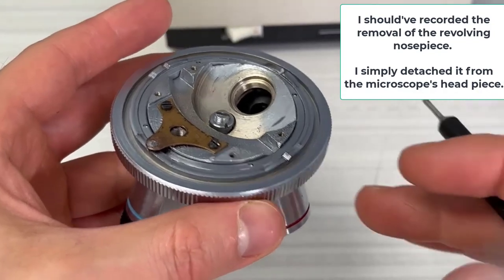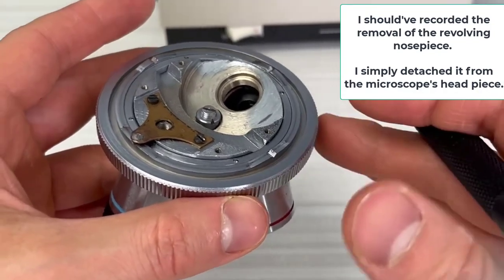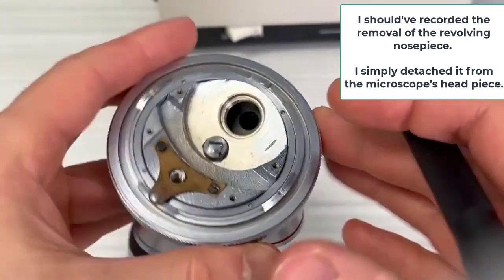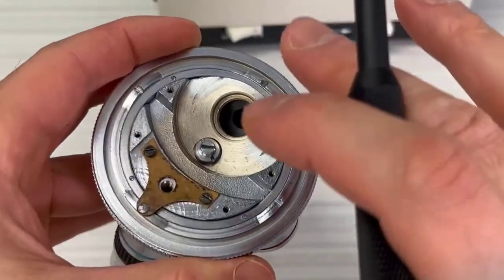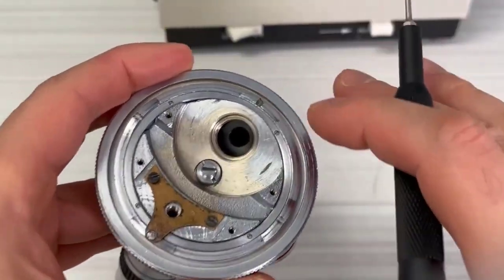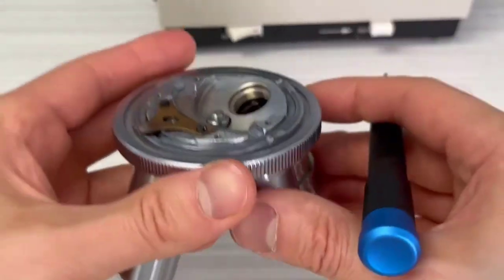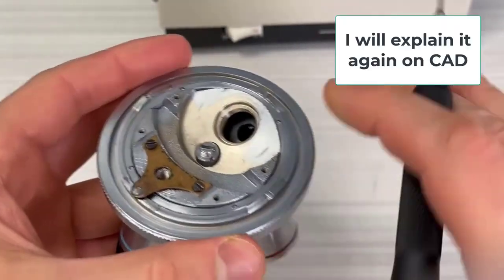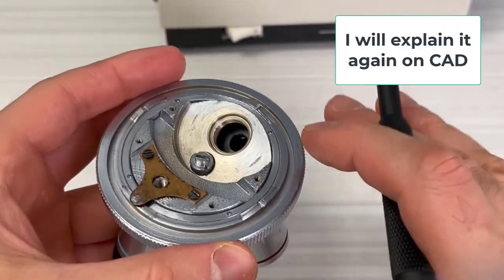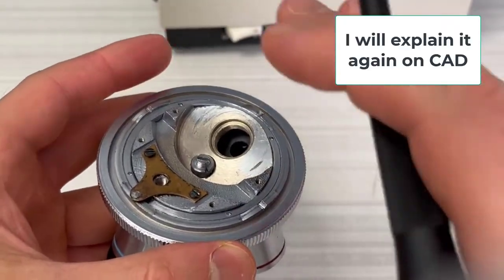As you may have guessed, this is a detent mechanism. Now let's take a look at the big picture. If you don't understand the mechanism while I explain it with the parts now, don't worry. I will go over it again on CAD.